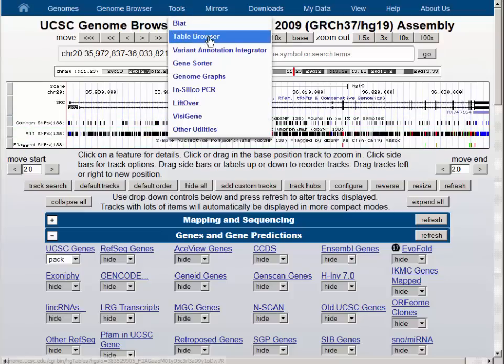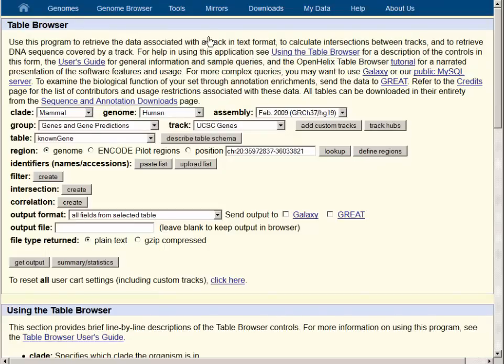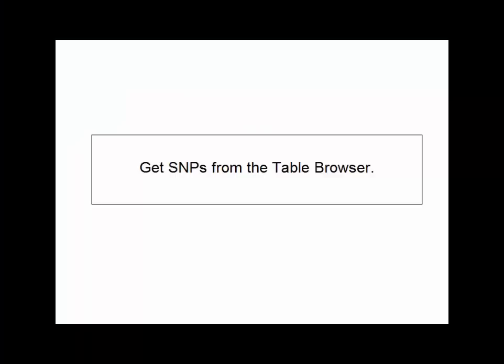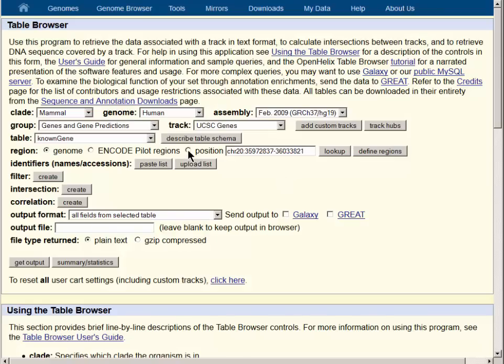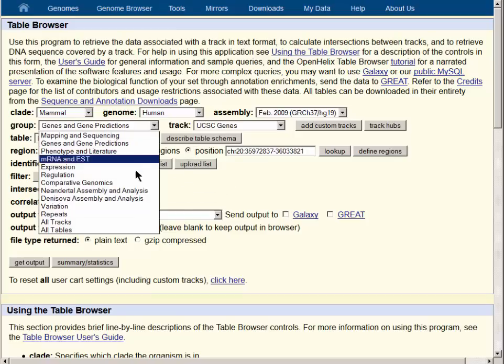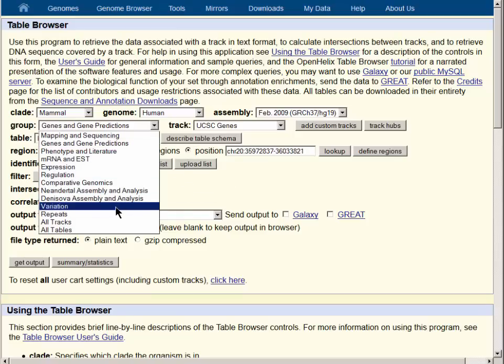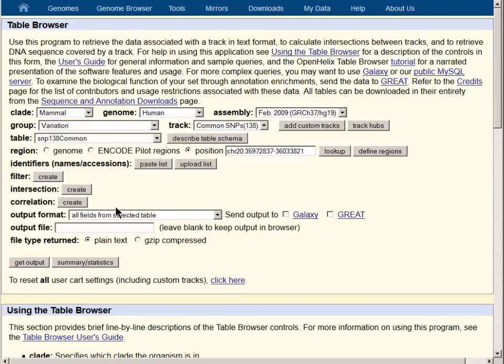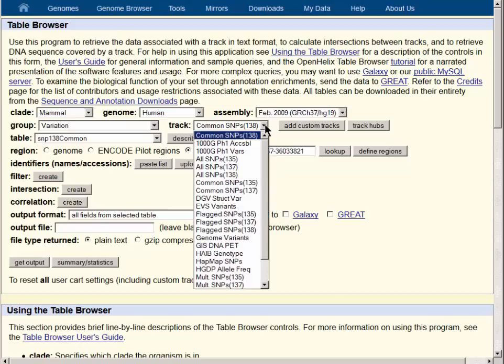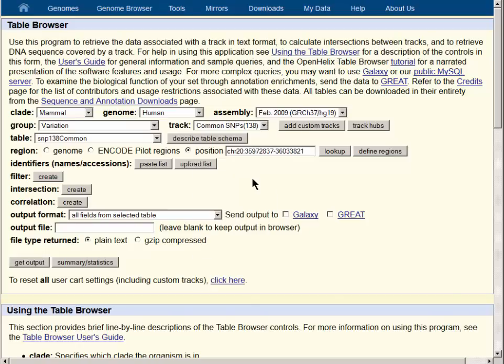We will go to the table browser and use one of these tracks to find the SNPs in the gene. We will simply get the SNPs in this particular gene, and the genome browser remembers where we were on the previous screen, so the coordinates are preloaded, but it is necessary to click the position button. To find the SNP tracks, we will select the variation group to match their location in the track controls beneath the genome browser graphical display. We will use the common SNP track in this demonstration and get a list of SNPs.